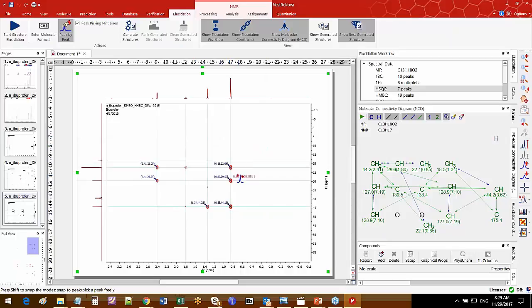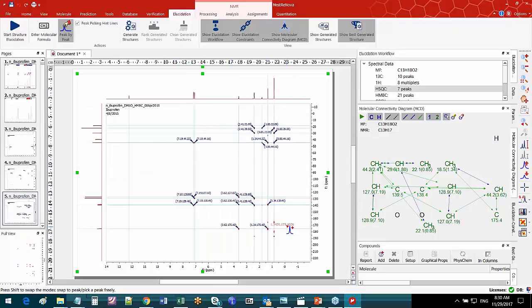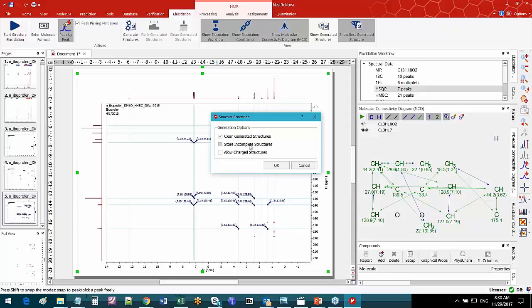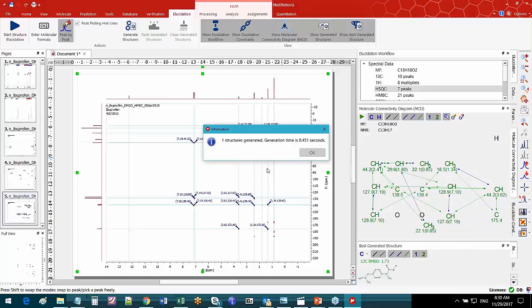Now we'll look at HMBC. There are usually way more peaks because we have two or three bond connectivities between proton and carbons. Here we have to be a little careful because HMBC can also show sometimes longer range connectivities, which at this stage the structure elucidation cannot use. If you have something longer range, you have to either manually tell it's more than three bonds or you just discard it. In practice, if I'm not sure, I would simply ignore it, but there's a lot of redundancies in HMBC connectivities. I'll pick peaks carefully around different regions. We can try structure generation now. Generate Structures—you have choices like clean up the display or store incomplete structures in case you don't get any complete structures. We will get one structure generated. It's very fast for this small structure.